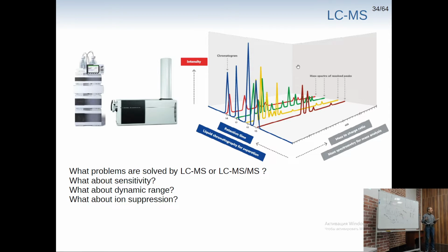And the intensity or the number of ions will be different, not only because it is different in solution, but also because we just follow some rules and there is nothing deterministic here. So that is what data-dependent acquisition is.